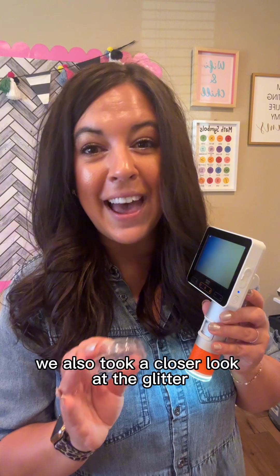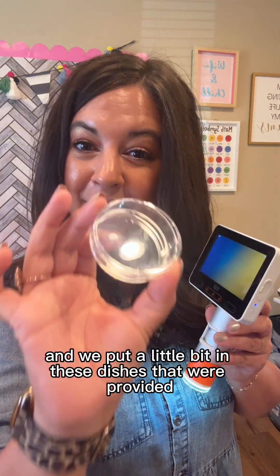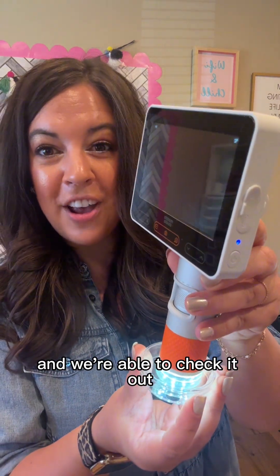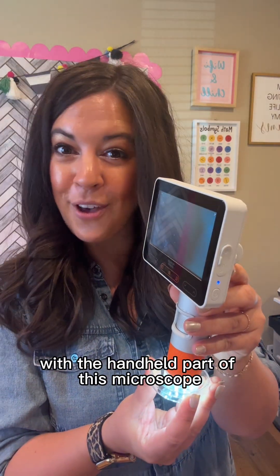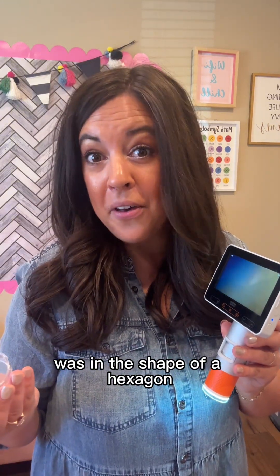We also took a closer look at the glitter that we were using in the slime recipe, and we put a little bit in these dishes that were provided, and we were able to check it out with the handheld part of this microscope. It's pretty cool because we actually found out that our glitter was in the shape of a hexagon.